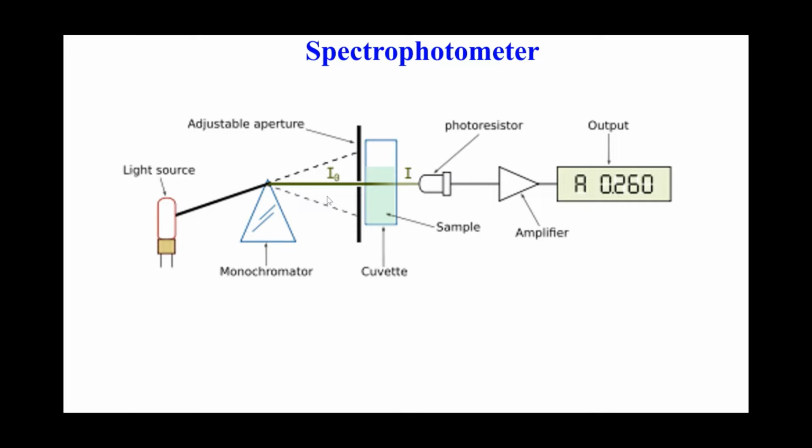Now we will see how these cuvettes look in the demonstration video, and I can give you the information that these cuvettes are available as plastic, glass, or quartz cuvettes, and we will require very careful handling of these cuvettes, as even a slight fingerprint can alter the results. So the light that passes through the sample is basically read and interpreted, which is being displayed at the output. Let's now move to the demonstration part of the spectrophotometer for better understanding.